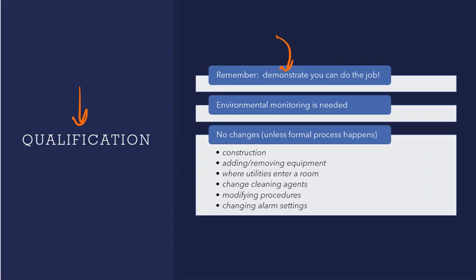With this process, environmental monitoring is also going to be included and required. So what that means is that we're going to be using those instruments that are going to be pumping air through it, and it's going to be taking a look.